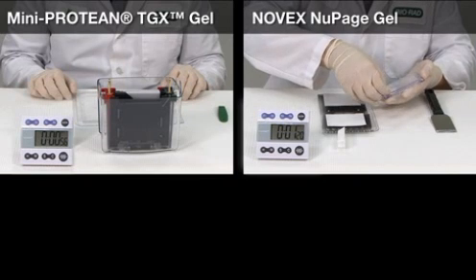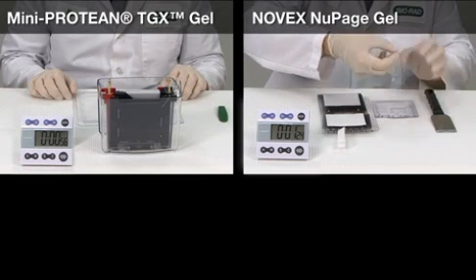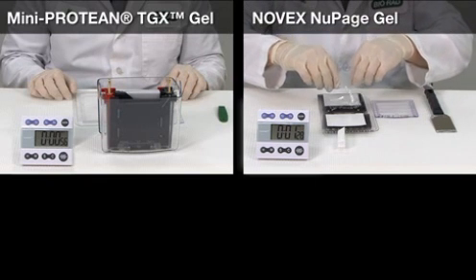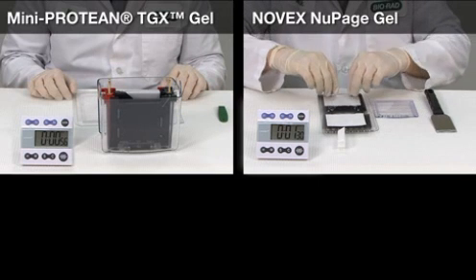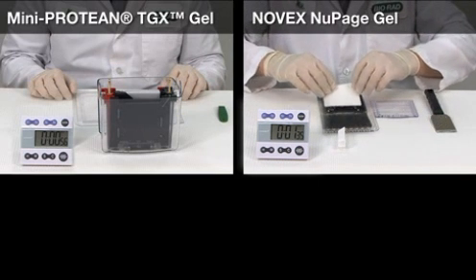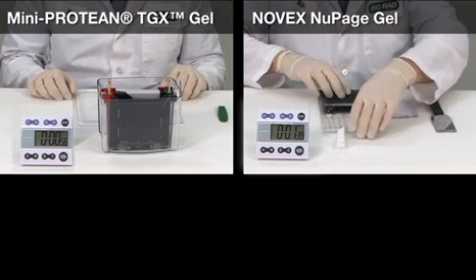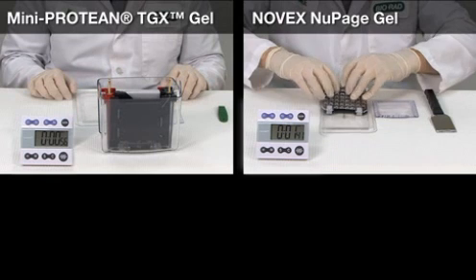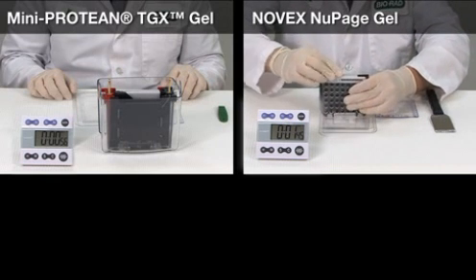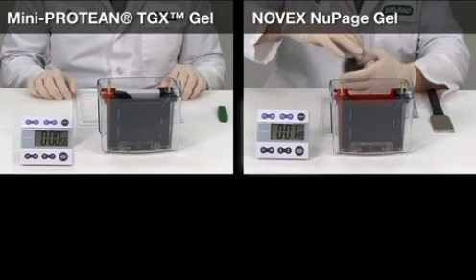The Novex NewPage gel is now ready for assembly into the blotting sandwich. The Viorad TGX gel has been finished for a while now.